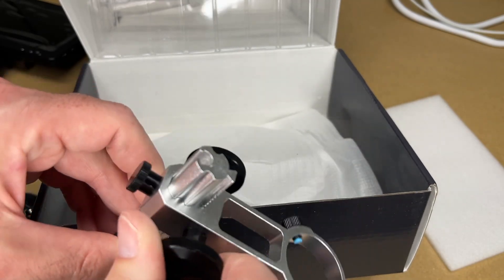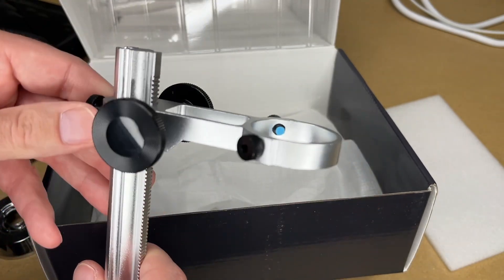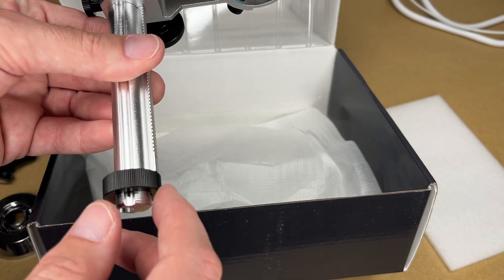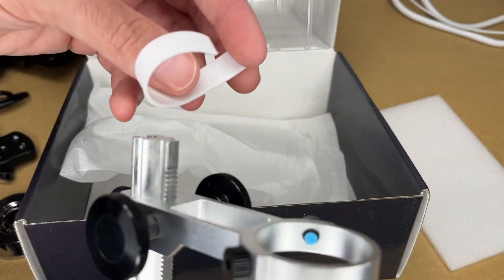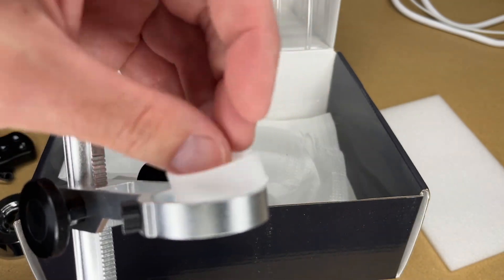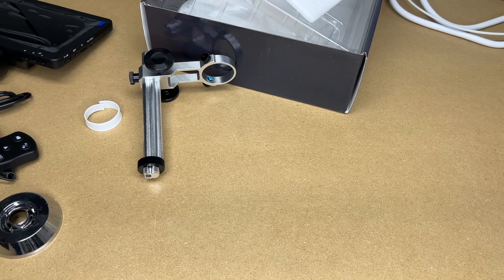Microscope calibration ruler. And here's the arm it goes on. There's a rack and pinion here to move it up and down. It has a lock in the back. This is the mount for the camera. There's a screw here. Looks like this is some rubber to go in here to pad against the microscope.